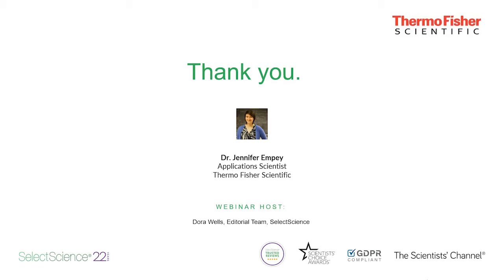I guess the one thing that I would point out is you would want to make sure that the sample has been shaken a little bit to make sure that the aggregates haven't settled to the bottom if you want to make sure you can see that aggregation effect. Okay, great. Excellent answer. Thank you for that. Another question we have is, would this method be suitable for studying peptide aggregation?